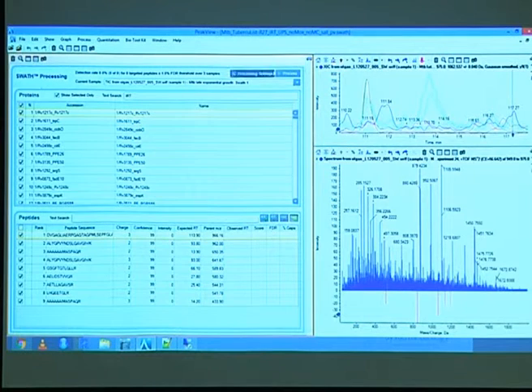What you can see is, if you go to that drop-down menu, there are these 3 files that I've selected. And if you select 50, there will be 50 files. You can go through them. You can pick just another one, and then it'll take a while, and then it updates that one and this one.